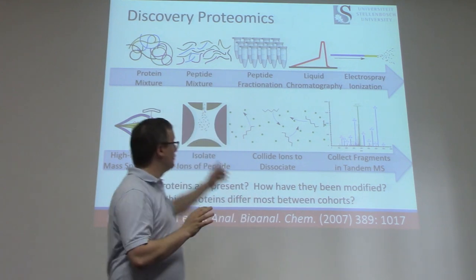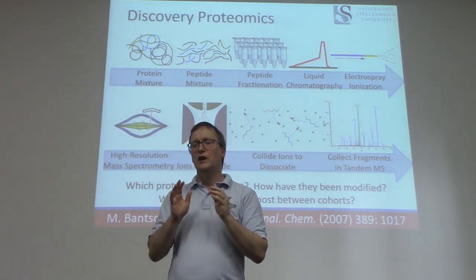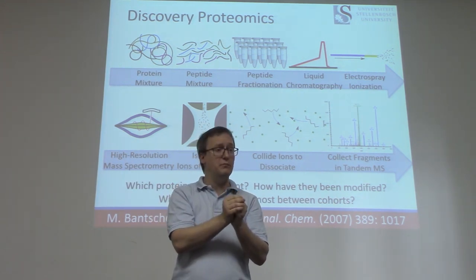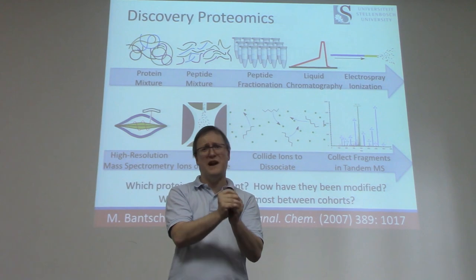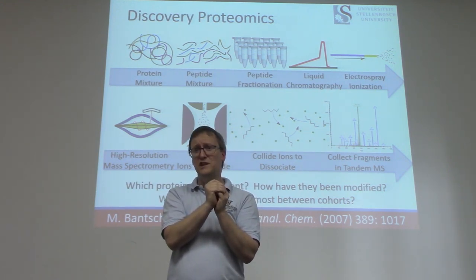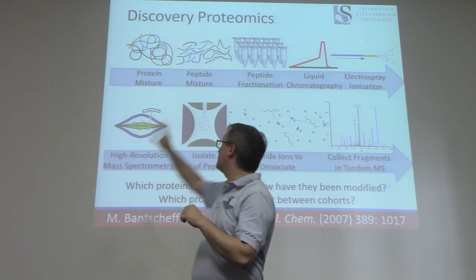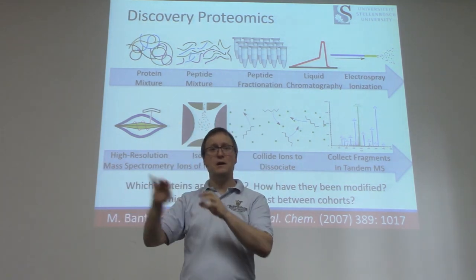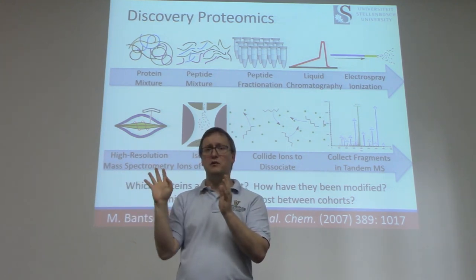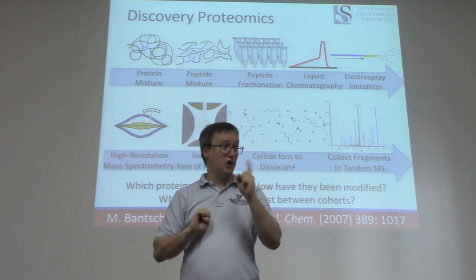Now, the second row of this all happens within the mass spec. So the ions have now entered the mass spec. Now, are they proteins, peptides, or fragment ions at this point? Are they proteins? They're not proteins because we already digested that up, right? So the trypsinization at the first step produced peptides from the proteins. Have we blown apart the peptides yet? We have not. We've charged them pretty heavily.